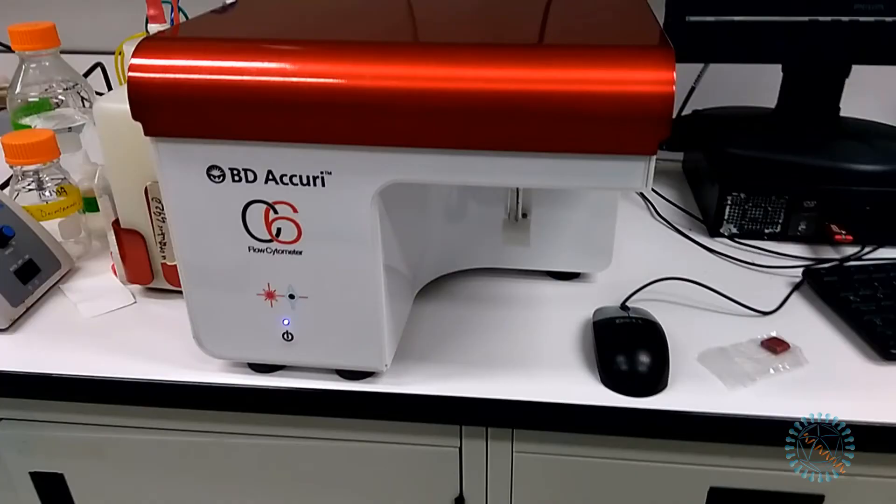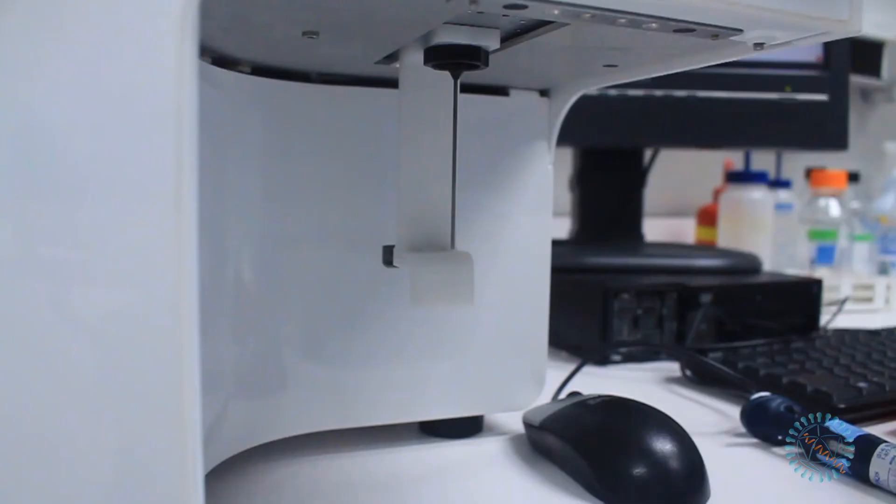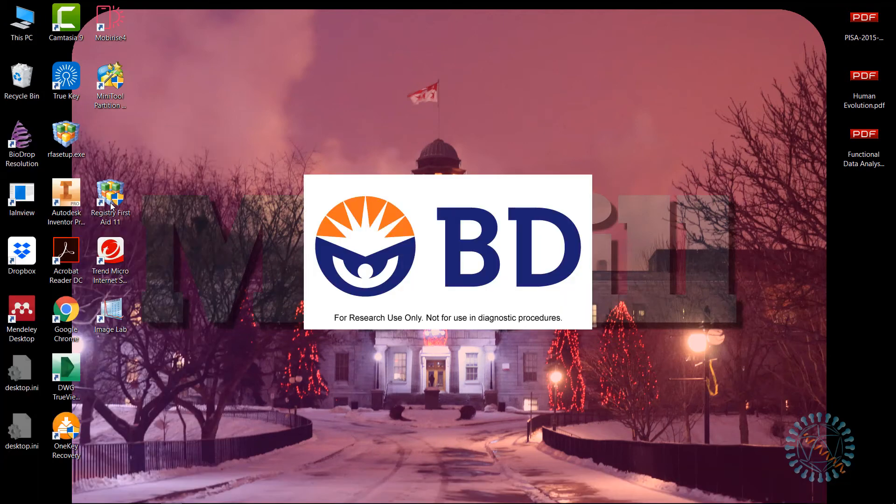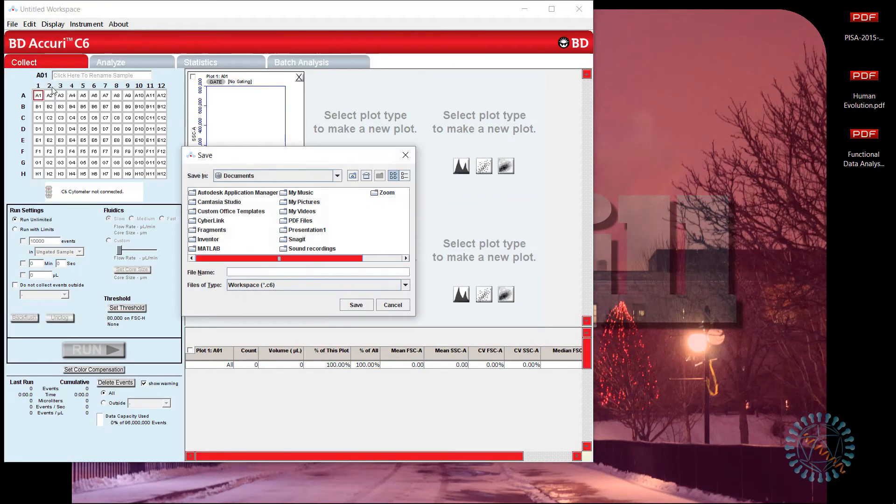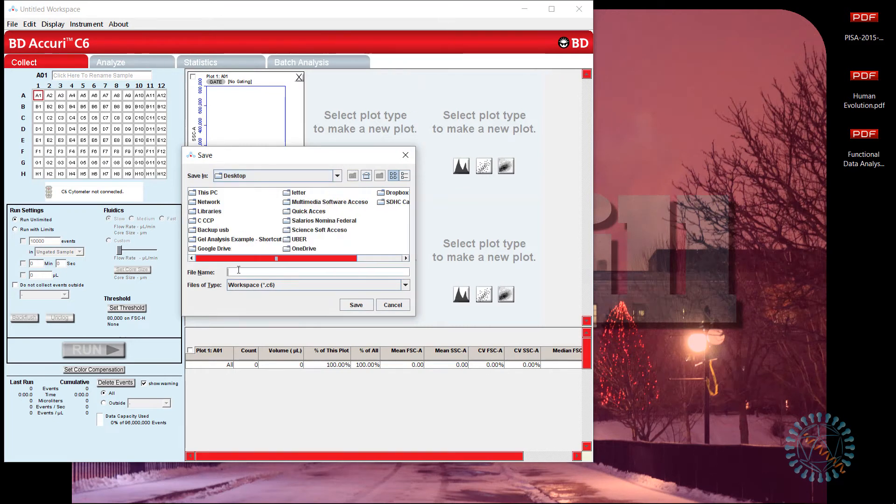Once we have turned on the equipment, it will be ready to go after 15 to 20 minutes. This waiting time is important for the laser to warm up and the fluidic and electronic systems to be stable. In the meantime, we will open the software that controls the data acquisition from the flow cytometer and we will create a new file and set up our workspace.